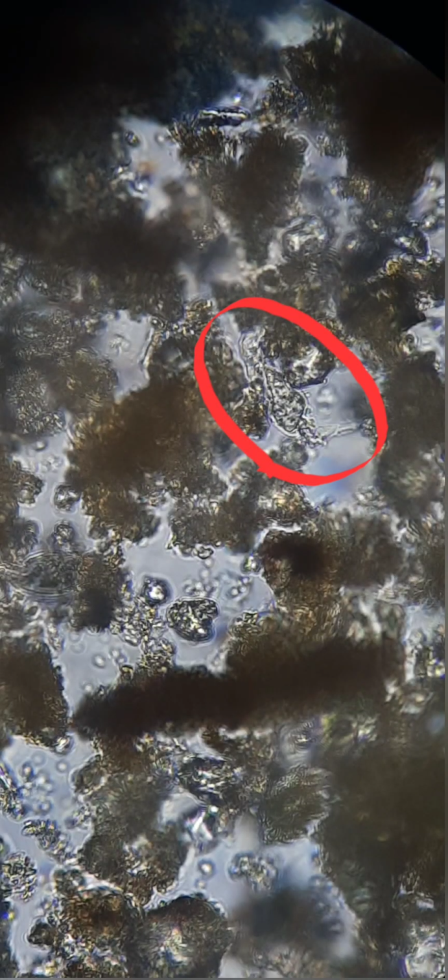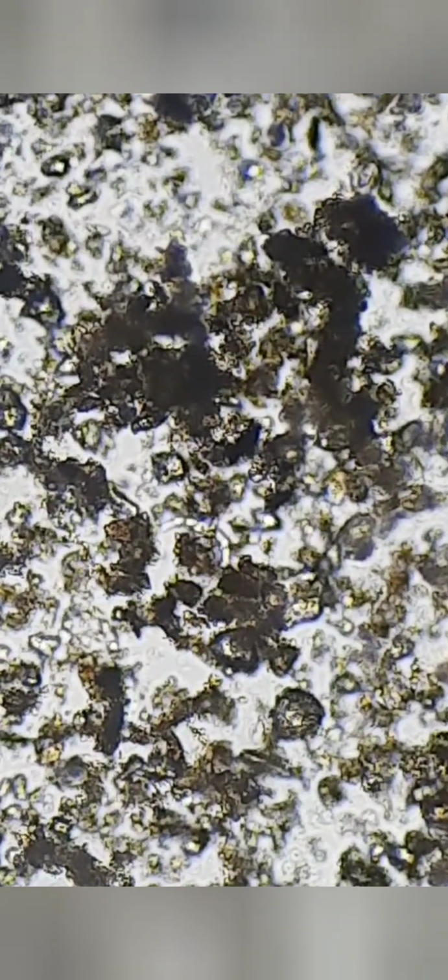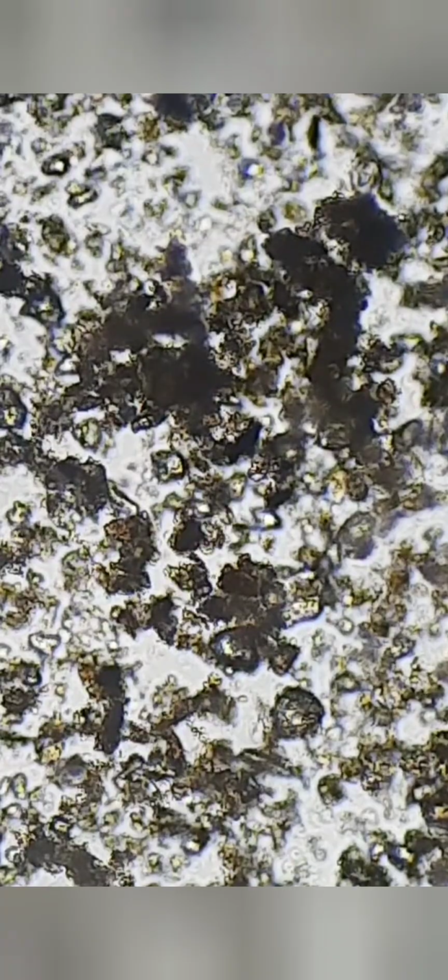Let's take a look under the microscope for an example of this benefit. Within this red circle is an organism that is hardly distinct from the environment around it. This is because the soil is so densely concentrated into one area that it makes it difficult to distinctly identify a transparent organism, even if it's moving. This was an example of the rightmost slide preparation.